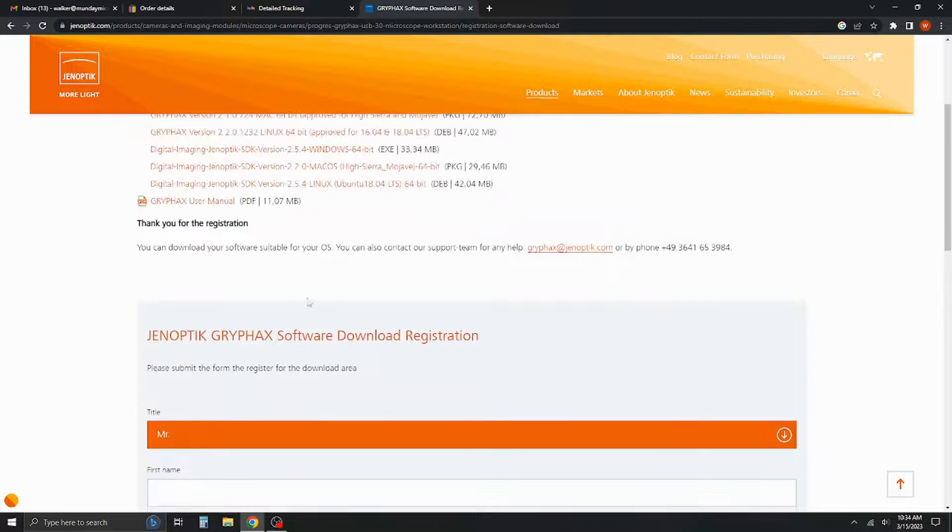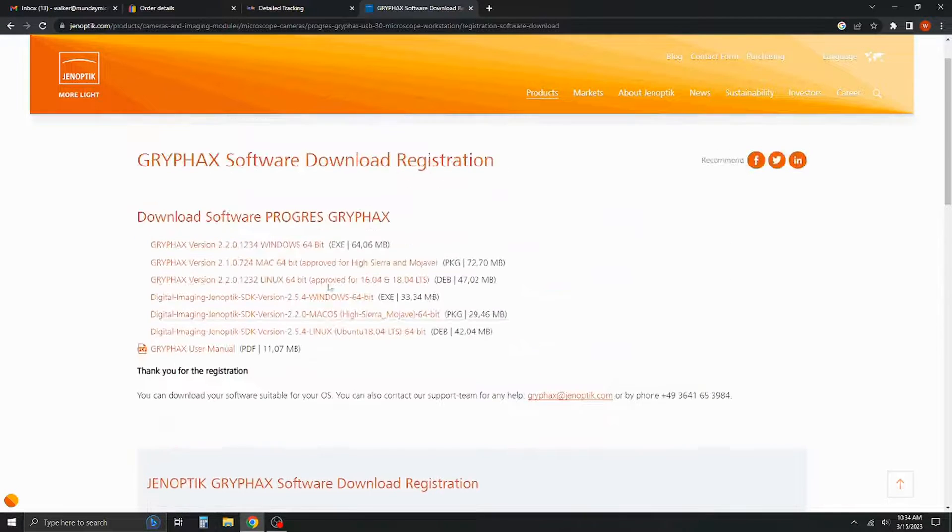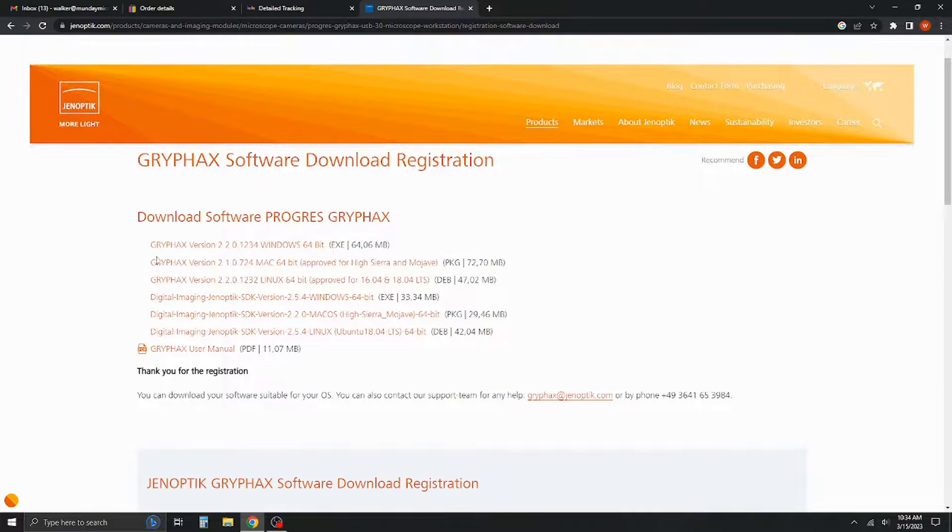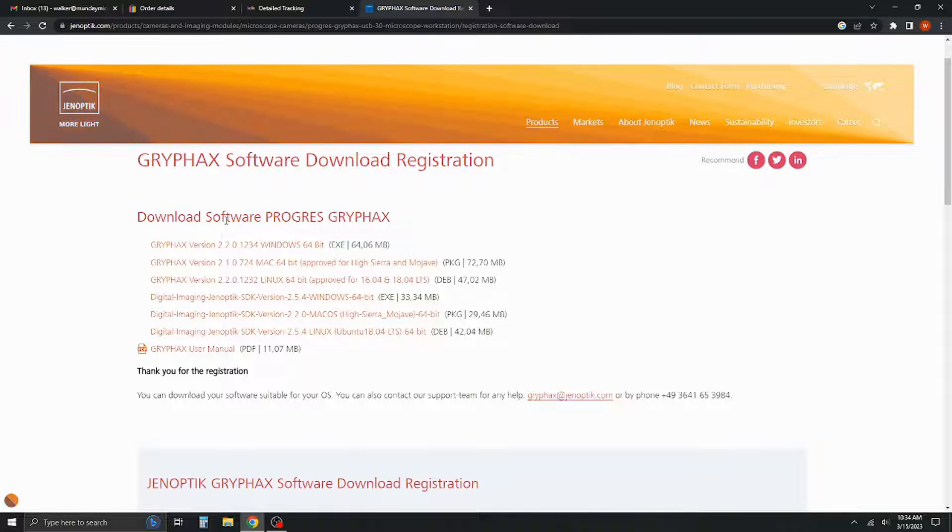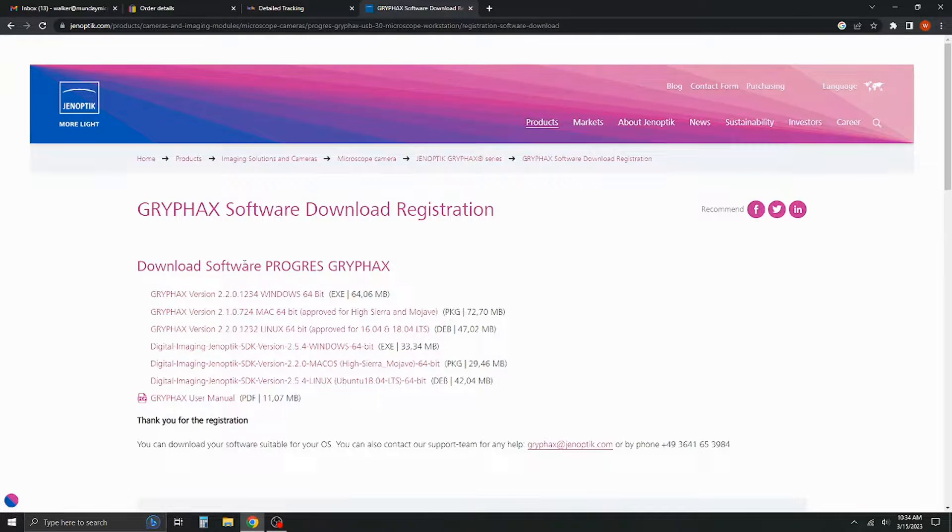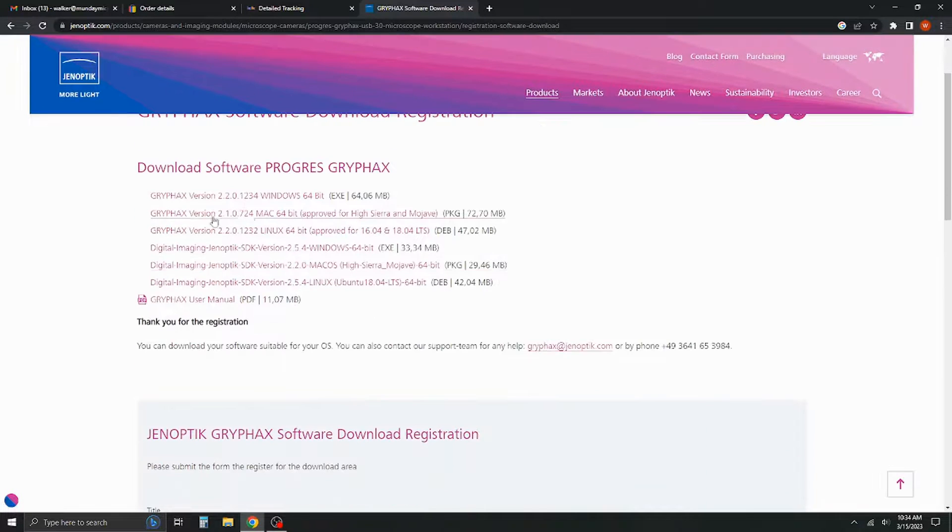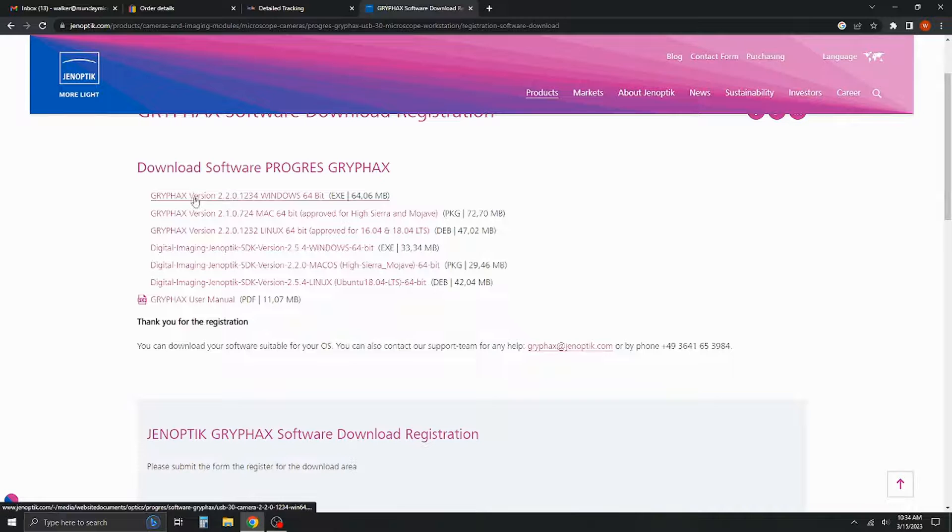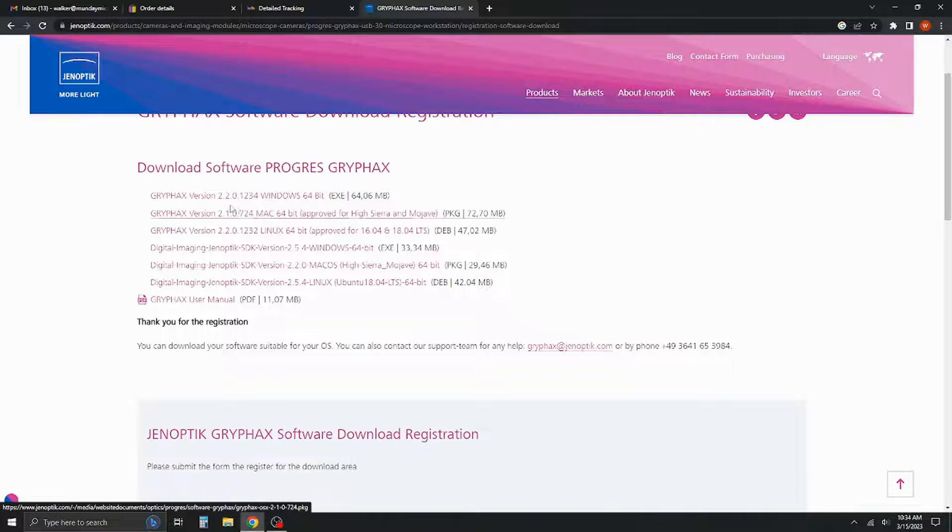I've gone ahead and done this registration, so we get this menu here, which is the download software for graphics. All you do is go through and select your version that you want.